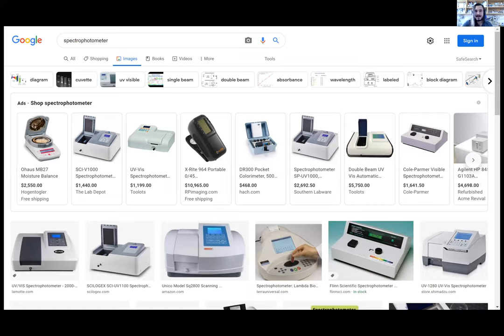And that particular concentration based off of a mathematical model will tell you something about what's going on in there. Either you're measuring chlorophyll or protein concentration or whatever. And it's dependent on the wavelength. Now, the most routine molecular biology wavelength that everybody uses is 600 nanometers, right? The optical density measurement at 600 nanometers is what people use to measure the rough concentration, with arbitrary units, and I can get into that a little later, the rough concentration of how much cells of E. coli are in your sample.